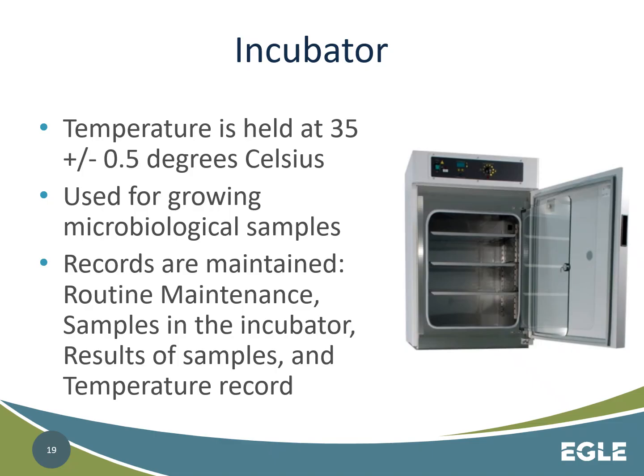So they're going to keep records of every sample that goes in and out of this: the time when the sample was placed in it, who placed the sample, and what the sample is and where it's from. And then on that same logbook, when they take the samples out for reading, they're going to also include the results of the samples, whether they were positive or negative for coliform, or if it's an HPC sample, we're going to talk about the number of colonies that was found at the reading time of the sample.